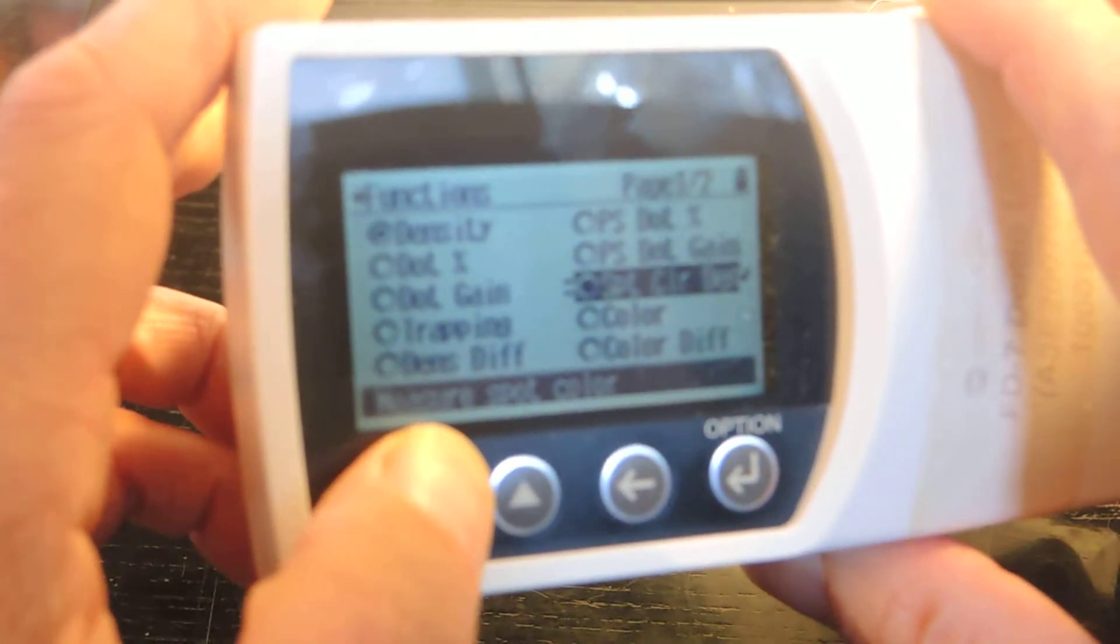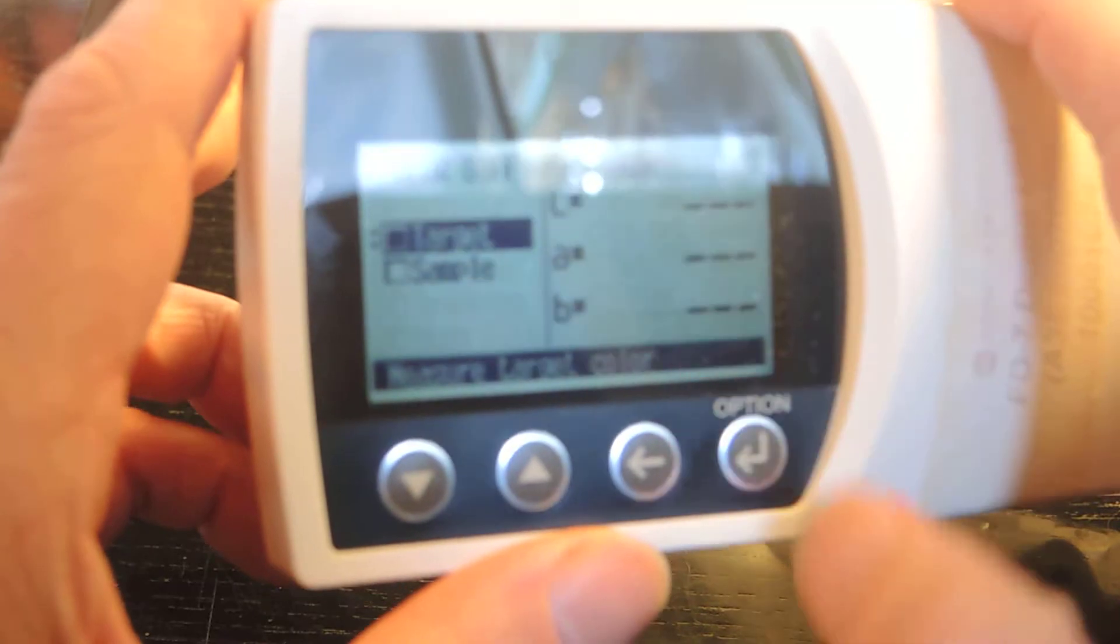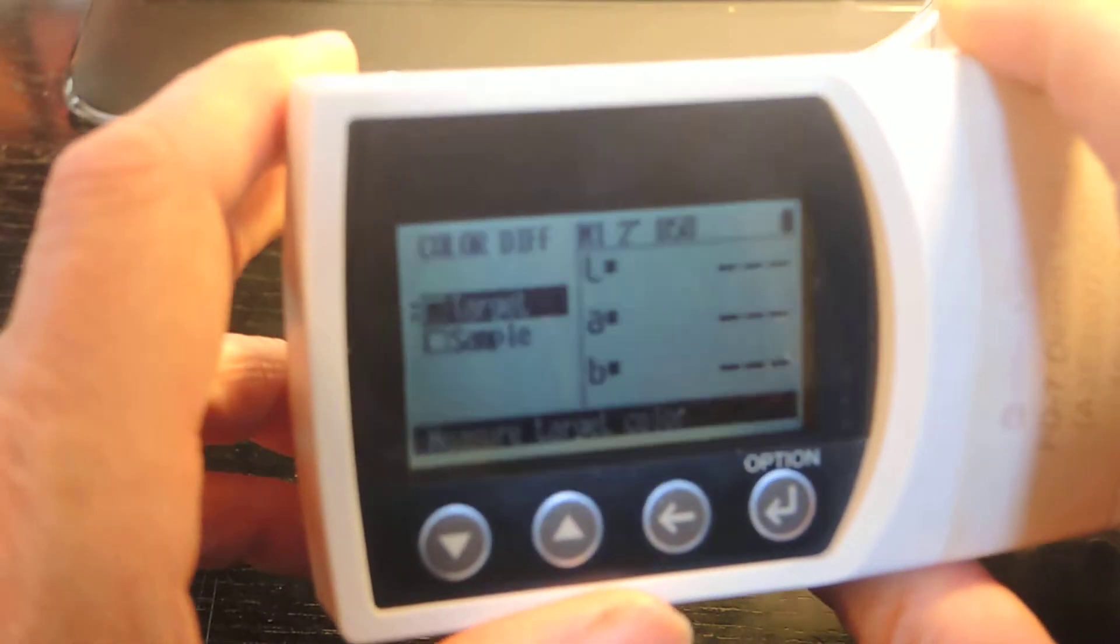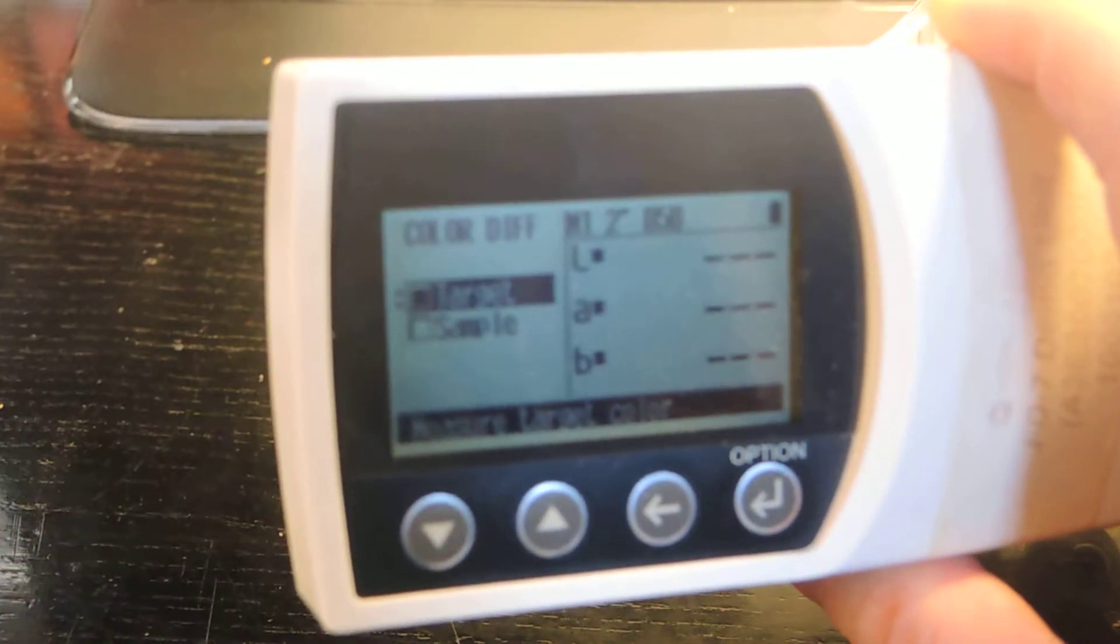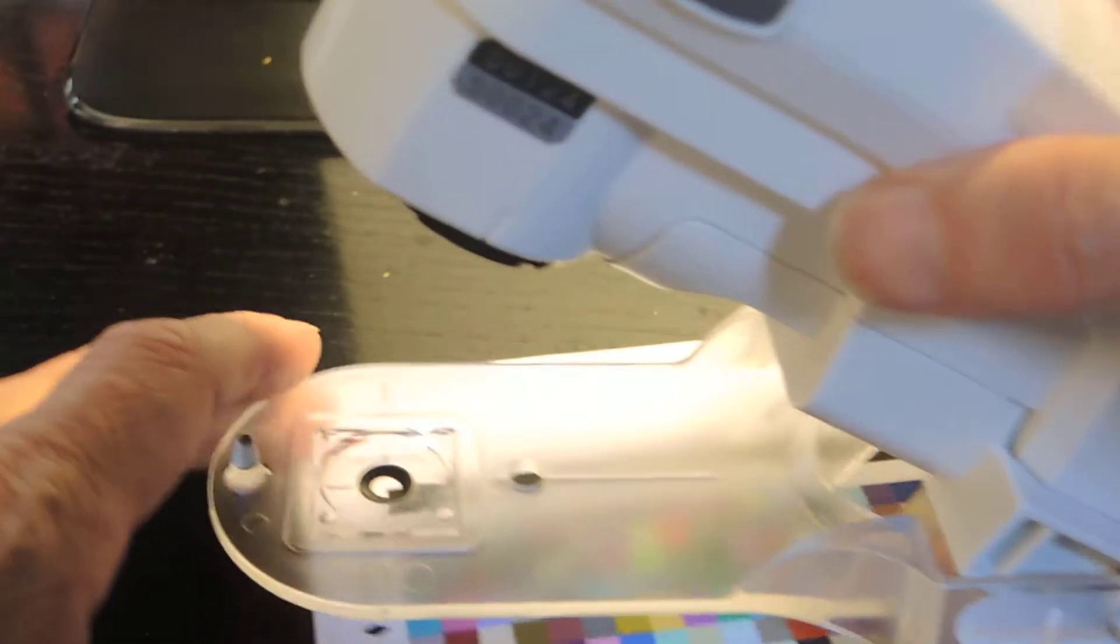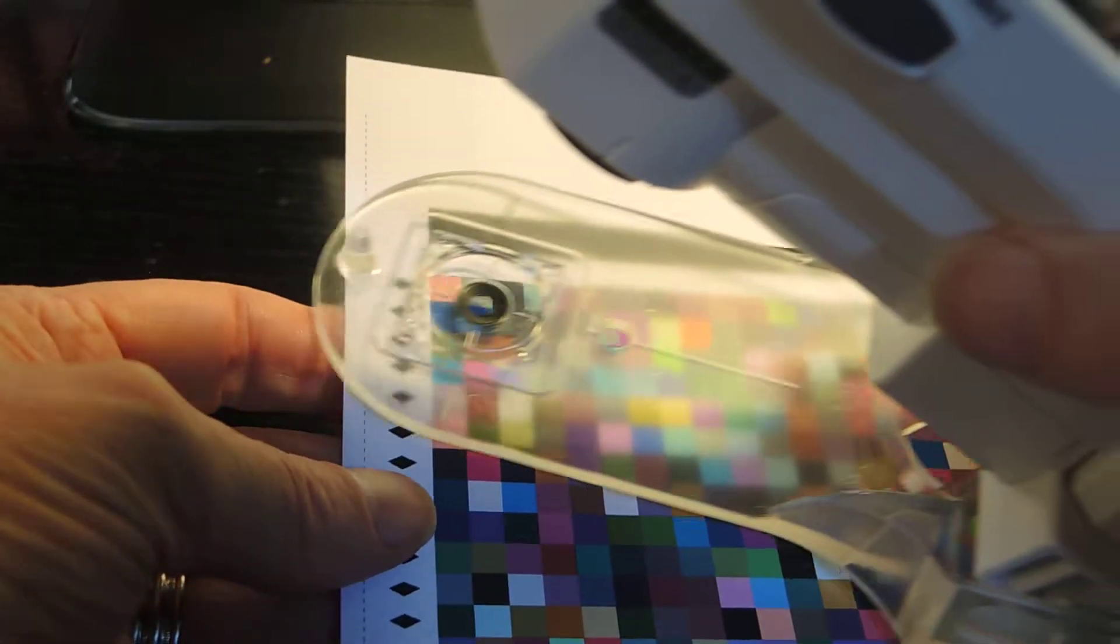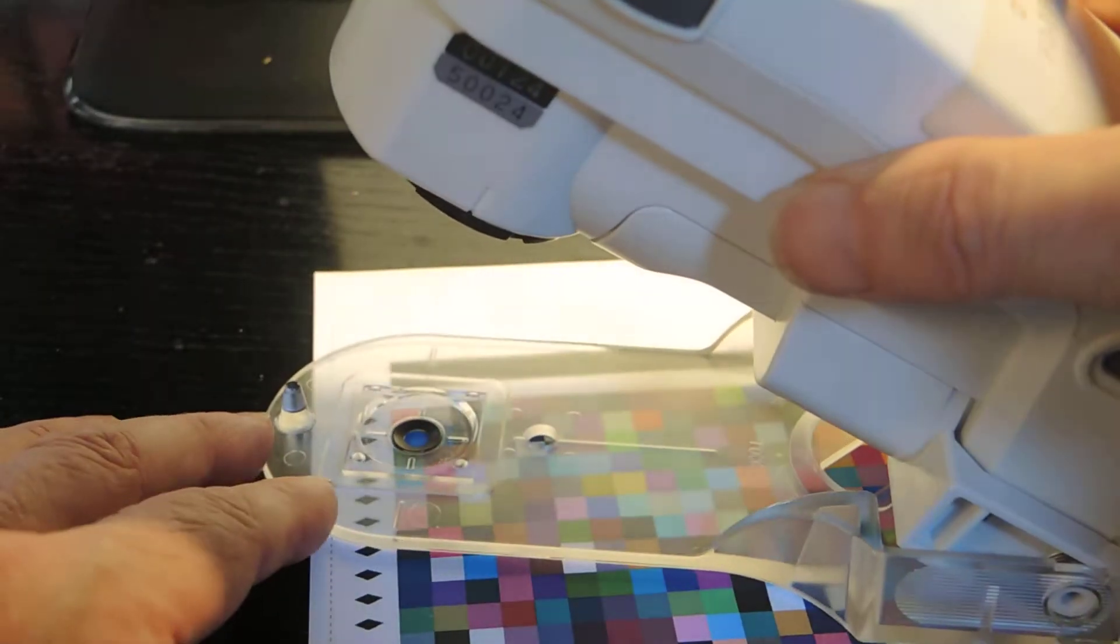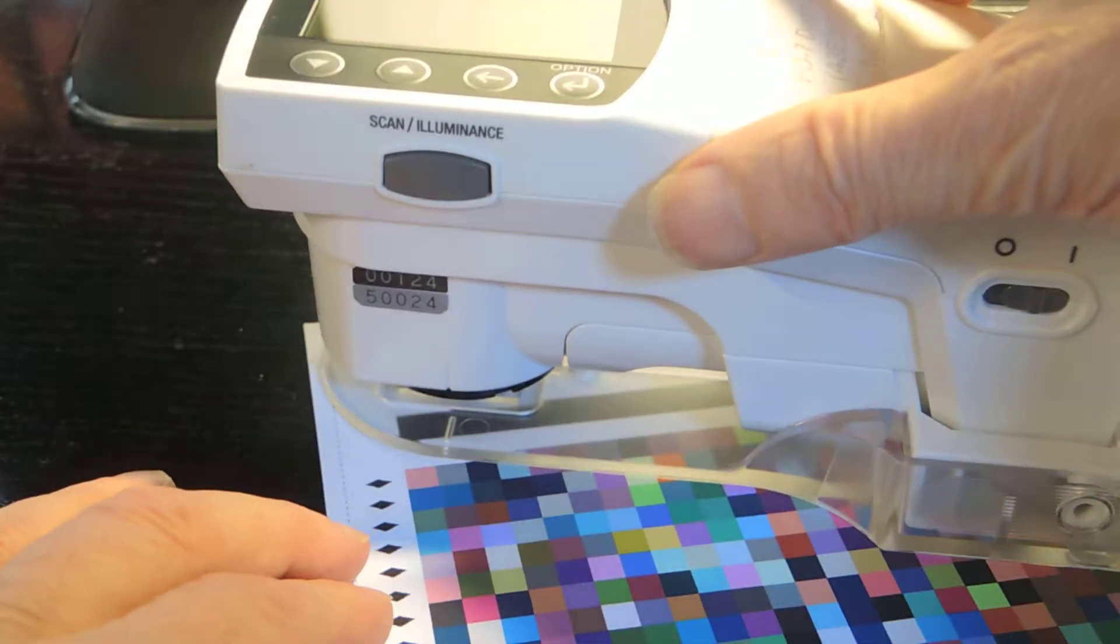Let's go down to color difference. See if I can figure this one. So first thing it wants, it wants the target. So let's see if I can get the target. Target would be, let's say this color over here, this sort of a blue color, whatever, or it could be the paper. So I'm going to read the paper.